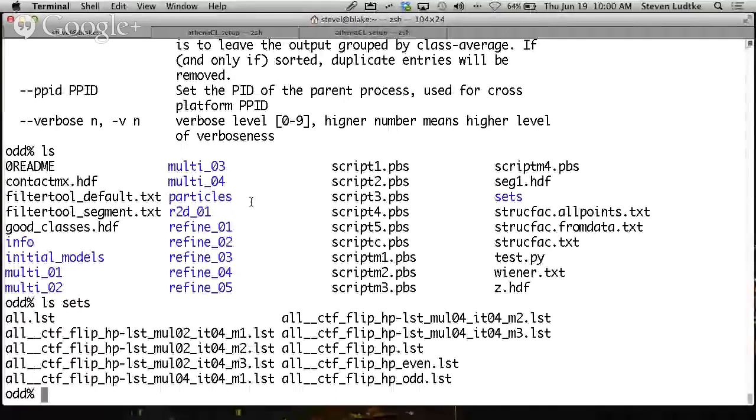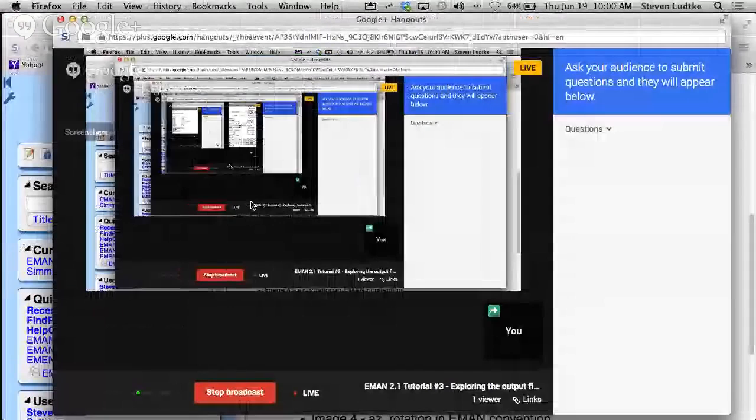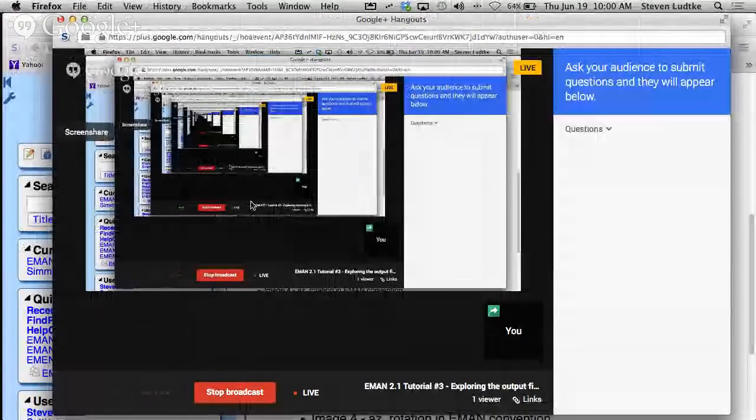All right. Well, we've gone for an hour, and I think we've covered the major output files from the major programs. So let's see if there's any questions that showed up.